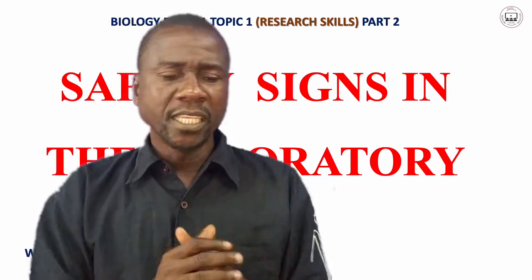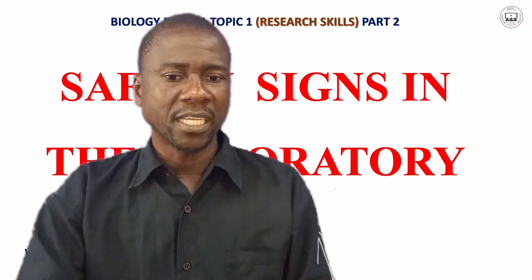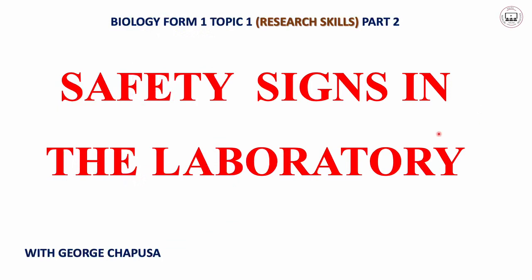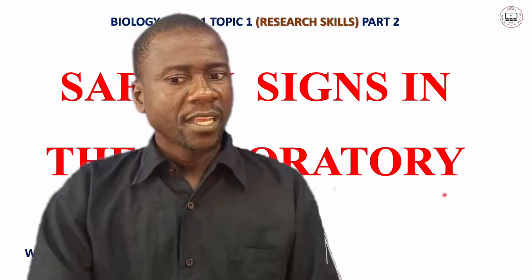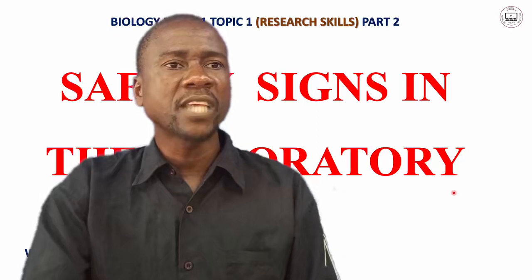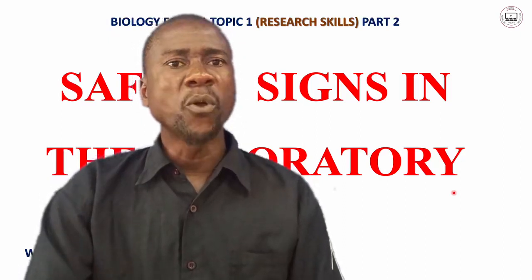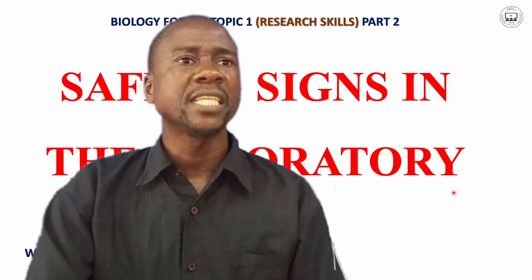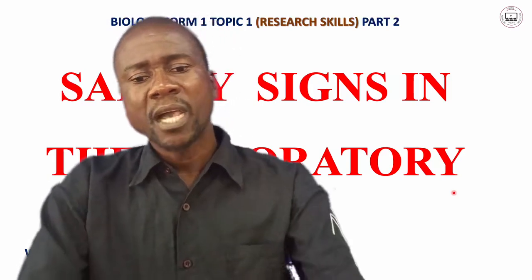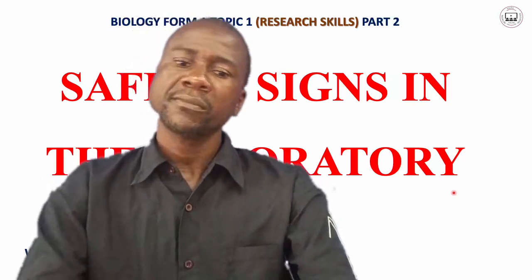But today, we want to share the safety signs in the laboratory. Remember, we are still doing research skills, whereby we learn so many things. As we are going to be studying biology, we are supposed to know different ways on how we may handle different things in this so-called biology.